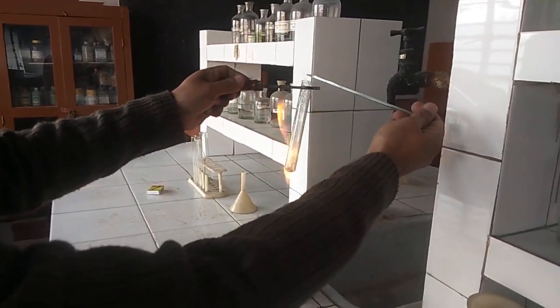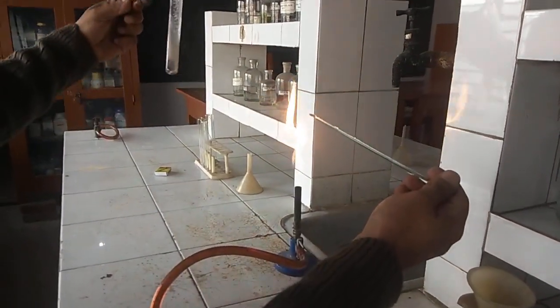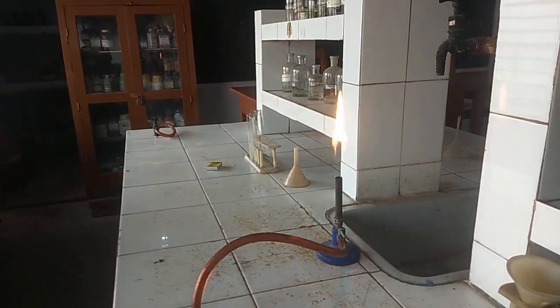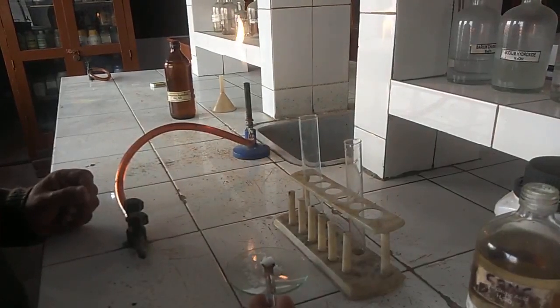The formation of dense white fumes confirms the presence of chloride ion in the salt. Basically, chloride ions react with ammonium ions present in aqueous solution of ammonia and form ammonium chloride. The white vapors formed are of ammonium chloride.